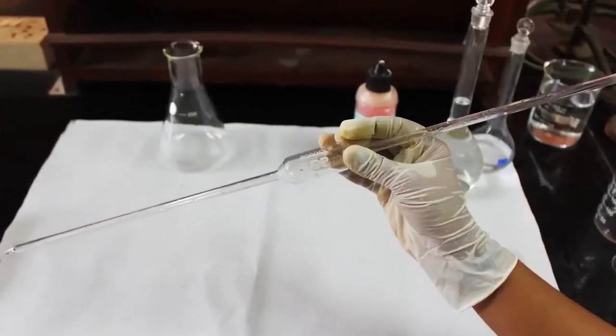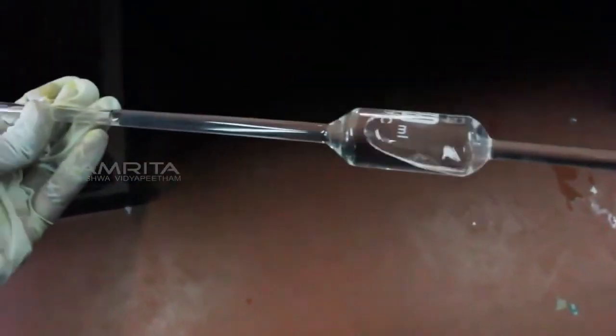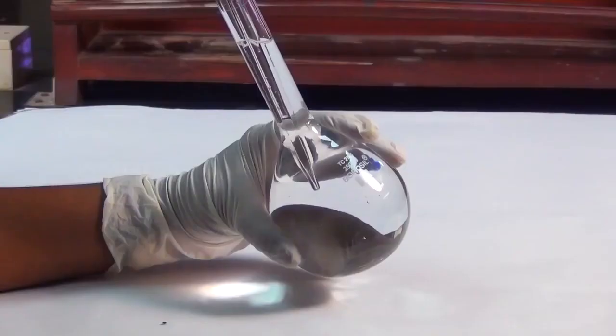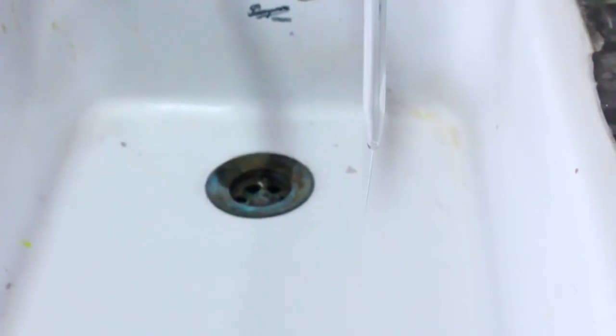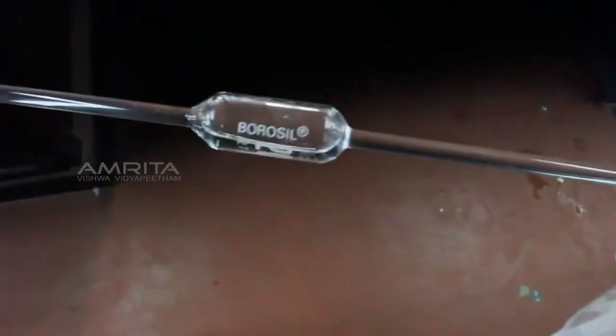Take a 20 ml pipette and pipette out some distilled water and rinse the pipette 2 to 3 times to remove the impurities from the pipette and drain out the washings. After rinsing with water, pipette out a small quantity of standard sodium carbonate solution and rinse the pipette and drain out the washings. Repeat this 2 or 3 times to remove any moisture inside the pipette.